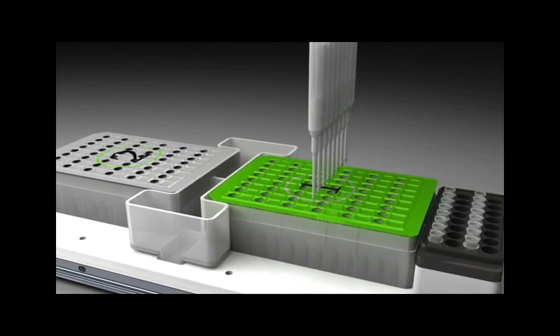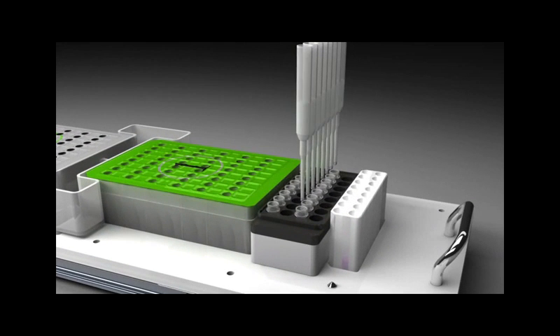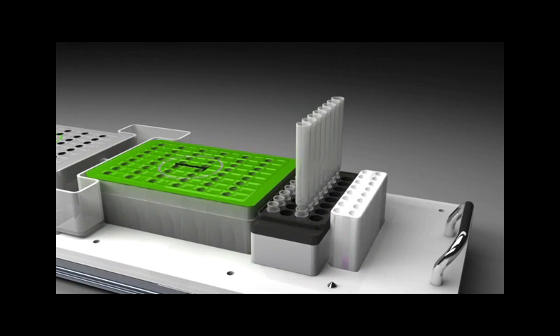Purified proteins are stored at 4 degrees Celsius in the cooling block and are ready for your applications, whatever they may be.